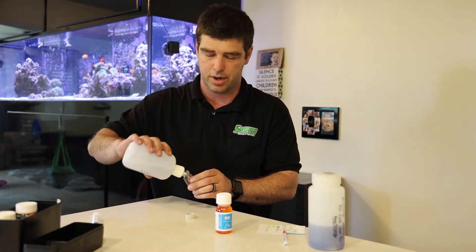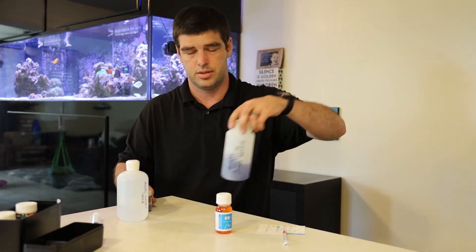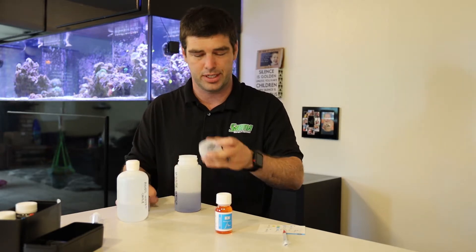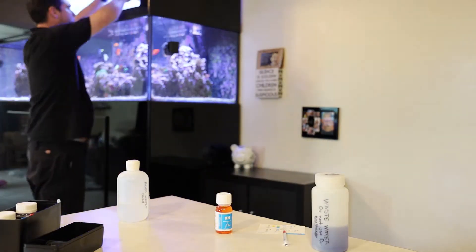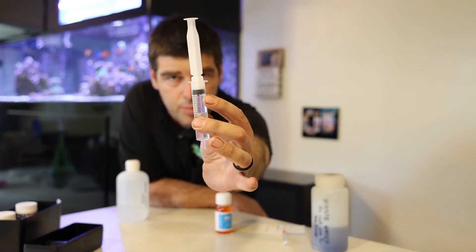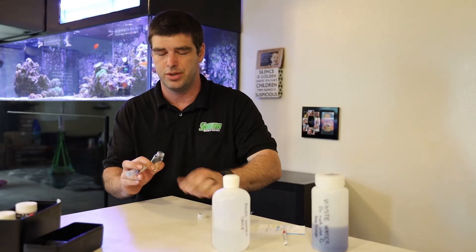I like to rinse the vials with RODI — it's just RODI out of my system. It's not super critical you do this, but I've always done it this exact same way so I'm going to continue to do it so that my tests are all done the same way. Got 10 mils of water. You'll notice there's some bubbles here at the top — don't worry about those.